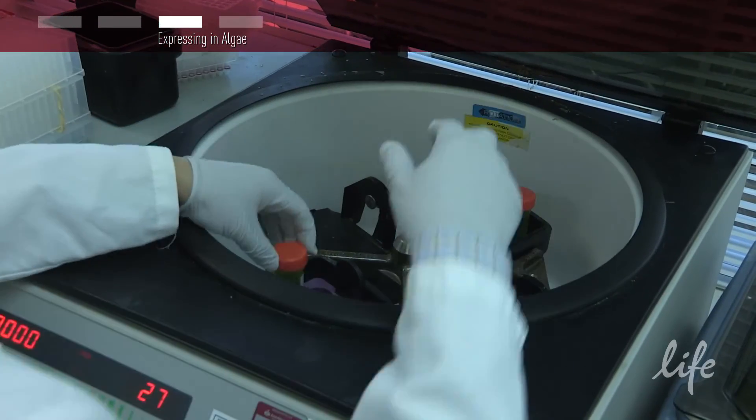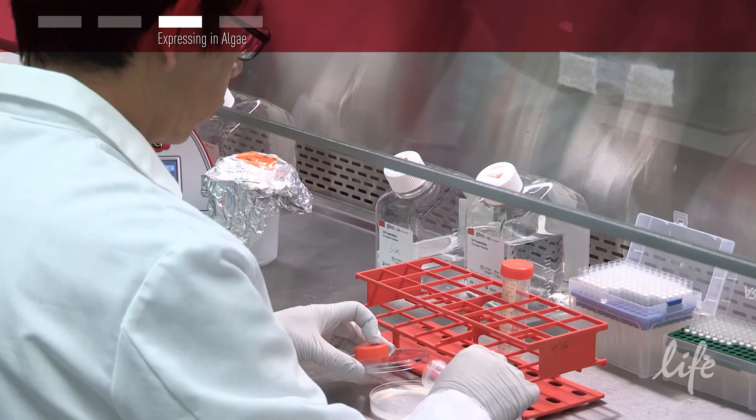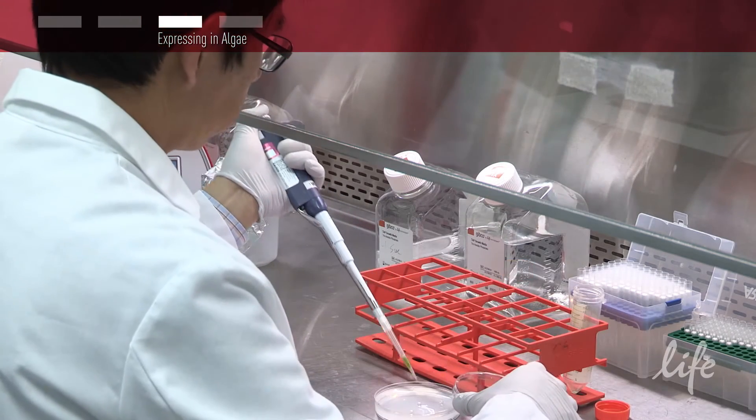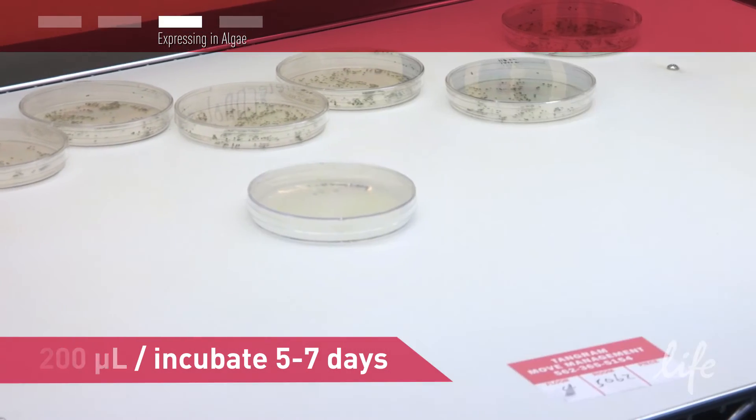The next morning, centrifuge your culture and discard the supernatant, and then resuspend the cells in the leftover media in the tube. Spread 200 microliters on a TAP agar plate and incubate for 5 to 7 days.